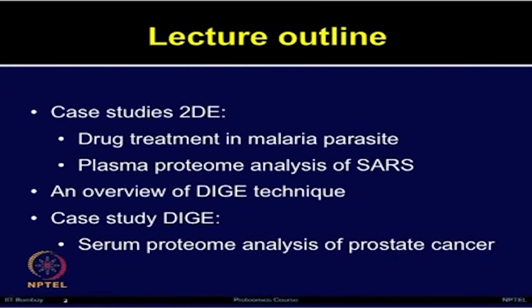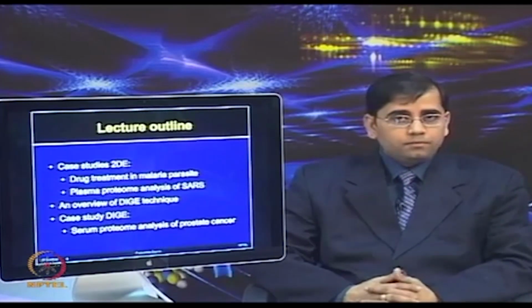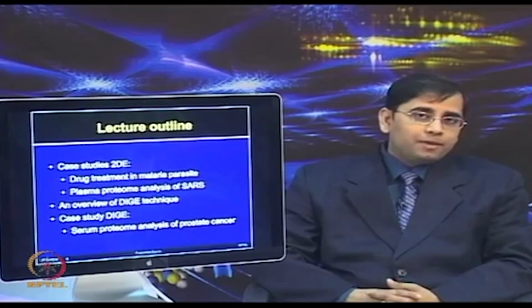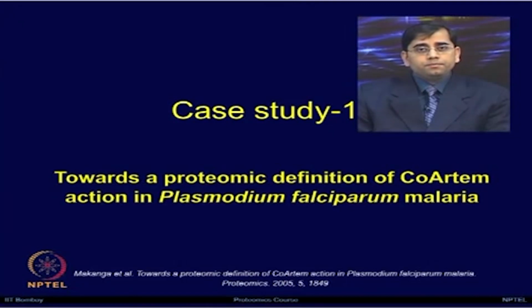What I want to convey is that there are multiple applications one can perform using this platform, and just to overcome certain limitations which are inherent to the conventional 2D, now people are also employing the 2D DIGE approach, but the workflow remains almost the same except for the sample preparation part, and then this powerful technology can be employed for several applications. So, let us start with the first case study.